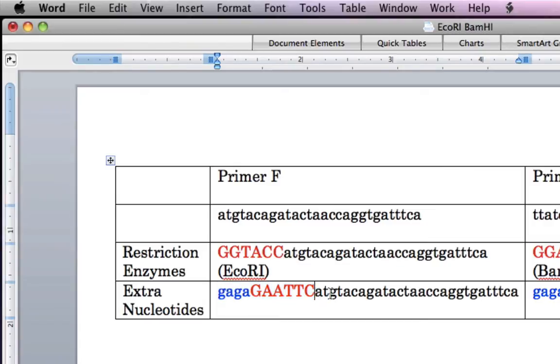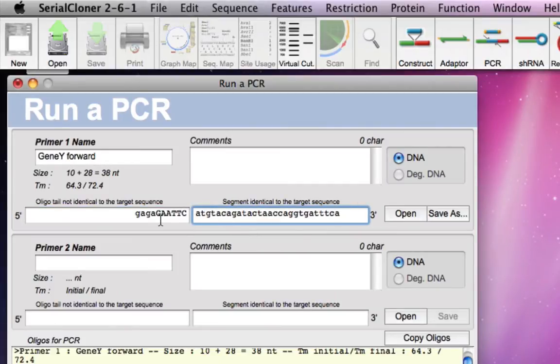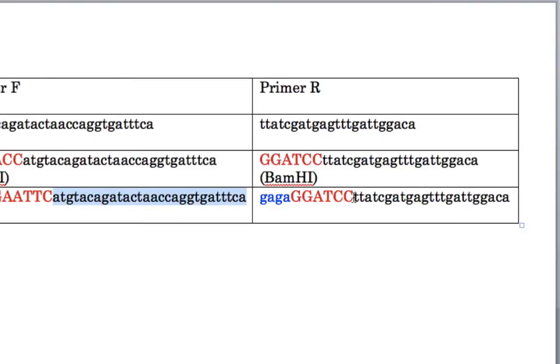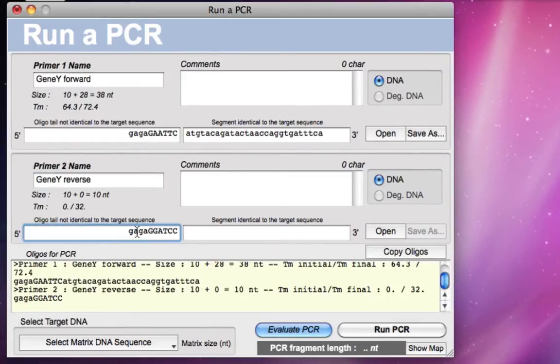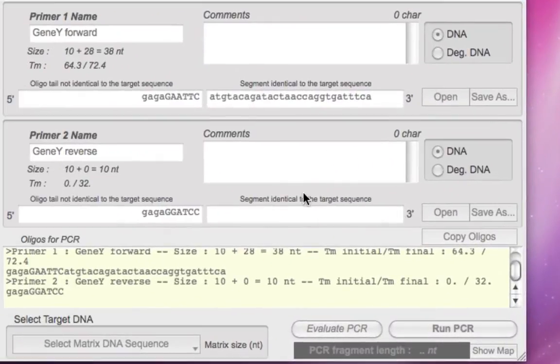For the forward primer, the region identical to the target sequence is the binding portion — paste it into the primer sequence field. Now for the reverse primer — gene Y reverse — the tail is GAGA plus GGATCC (BAMH1), which is the non-identical portion. We select and paste that as the tail, then select the identical binding region and paste it into the primer sequence field.